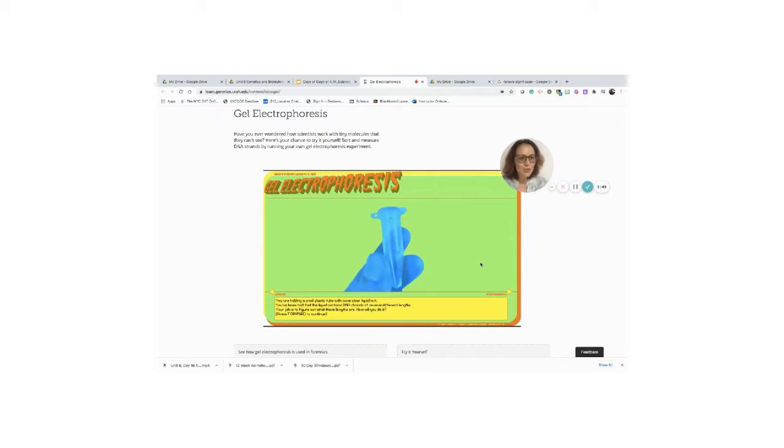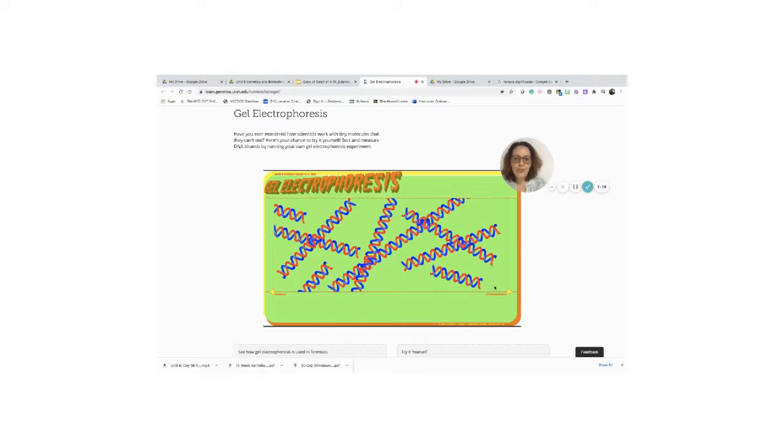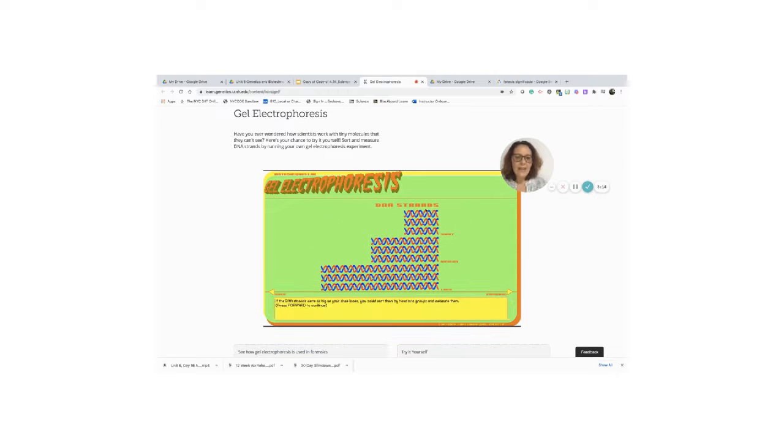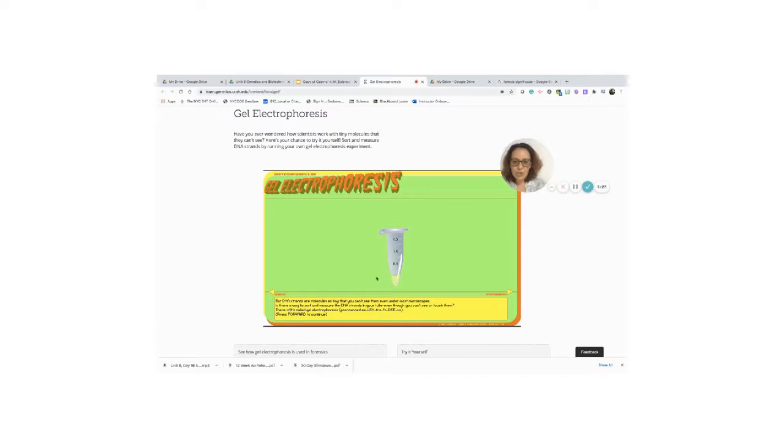All right, this is you in a lab and you're holding a small plastic tube with some clear liquid in it. You've been told that the liquid contains DNA strands of several different lengths. Your job is to figure out what those lengths are. How will you do it? We're going to click forward, all right? And we can see the strands of DNA in here, and they are either short, medium, or large. Look at this tube in here.